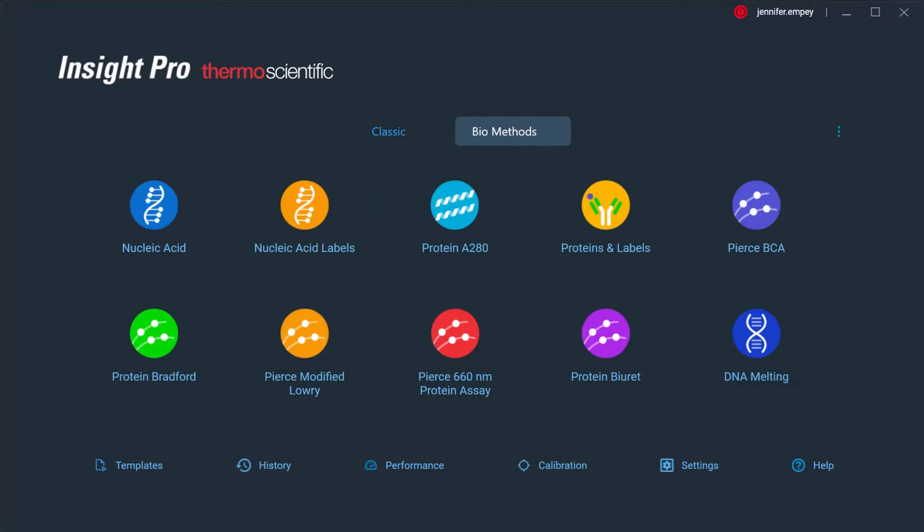In addition, there are several presets designed for common biological assays and methods.